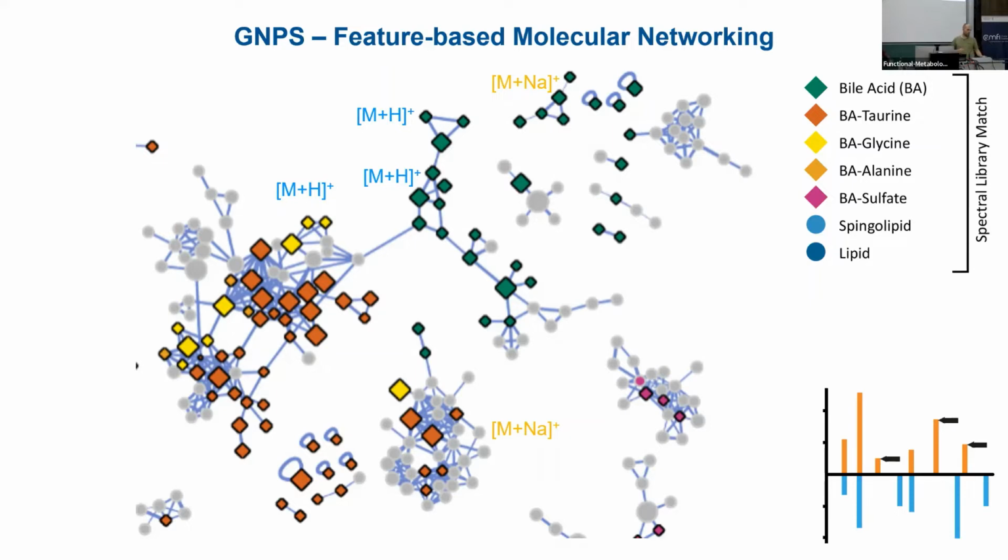I would also like to stress that we only see different adducts here, but you should also be cautious that you can have in-source fragmentation. I know someone who was always looking for fragile molecules, but the in-source conditions, like the drying gas and the declustering potential, were all set too high, and so she was always losing her glucose or whatever was on there. And even for the bile acids, we can see that free bile acids tend to have very intense, even more abundant, M minus water. They have water losses because of all the hydroxy groups in the aliphatic system.